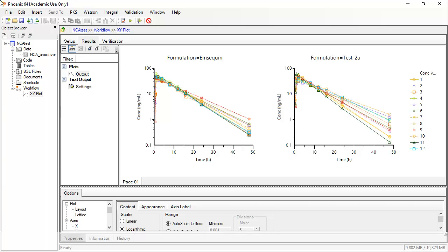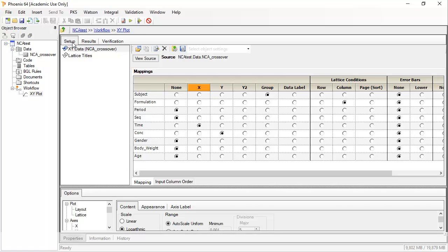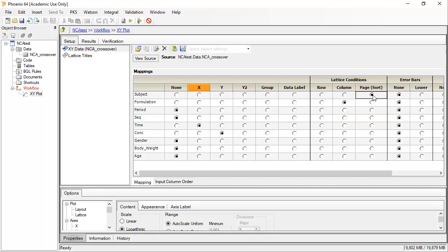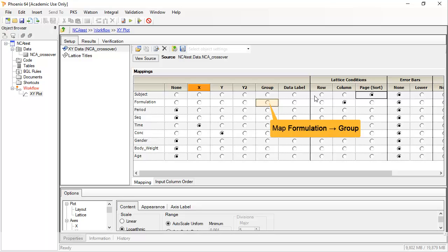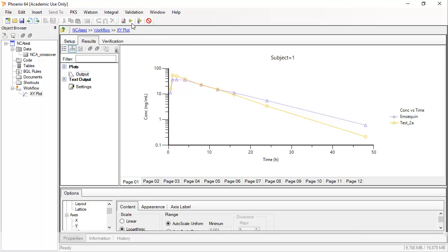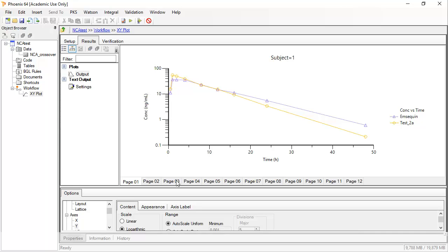The variables being plotted can be changed by returning to the Setup tab and changing the mappings. If we want a single plot for each subject with both formulations, Subject can be remapped to Page — i.e., Sort — and switch Formulation to Group. Clicking the green arrow will re-execute with the new mappings, giving 12 pages, one for each subject. To rename the plot object, double-click or use the F2 key.